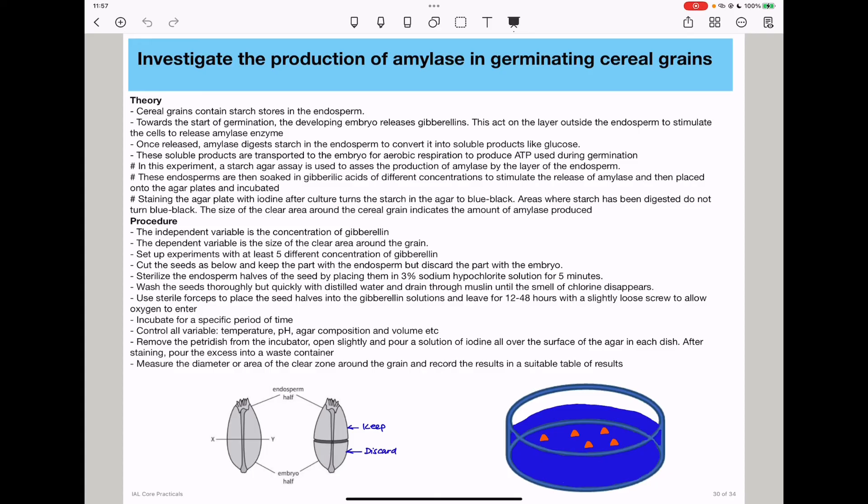The sample with the wider diameter had the greatest amount of digestion. Therefore, that concentration of gibberellic acid led to the release of the greatest amount of amylase and had the greatest digestion.